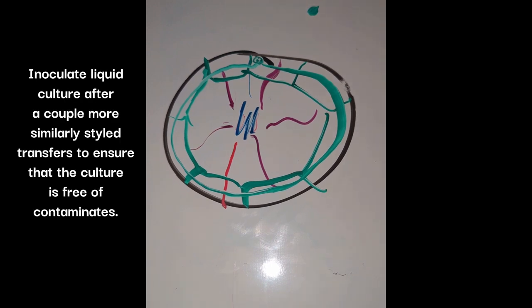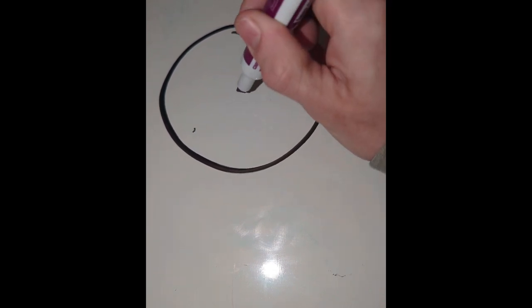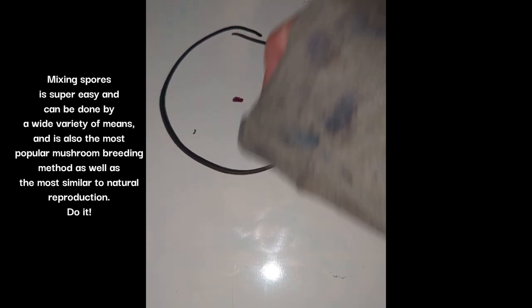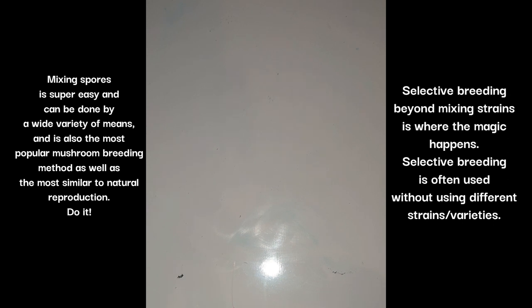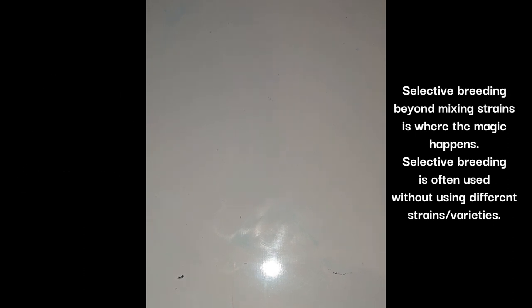Another thing I've done is make a spore syringe with two different types of spores. So you just take some water, mix your spores in it, and then when you go to put it on your petri dish, you can assume that if you take one drop, there's going to be a little mixture of the reds and blues. Another thing I've seen people do is double swab a mushroom, where people take swabs of two different spores and play with that.